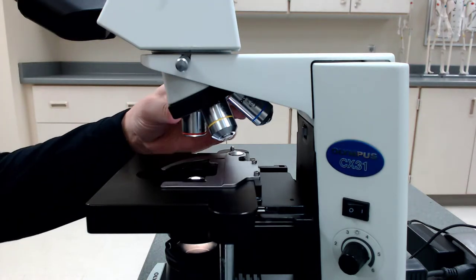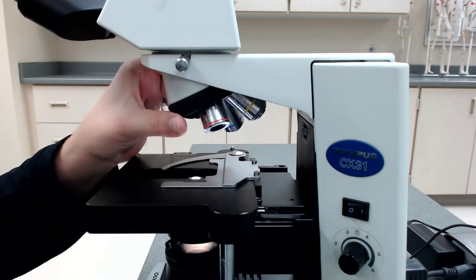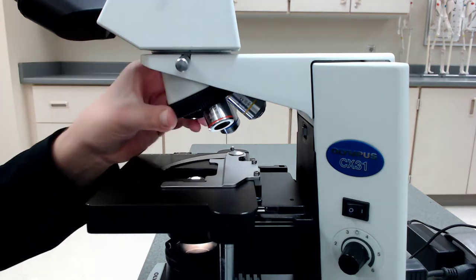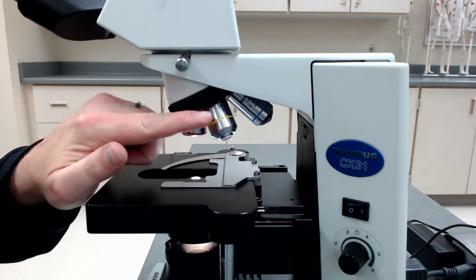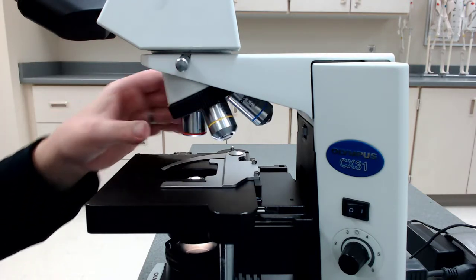It's called a binocular parfocal microscope because of these objectives here. So here we have the scanning power. Let me turn it towards you a little bit. The scanning power, 4x objective. Here we have the yellow, low power, 10x objective.